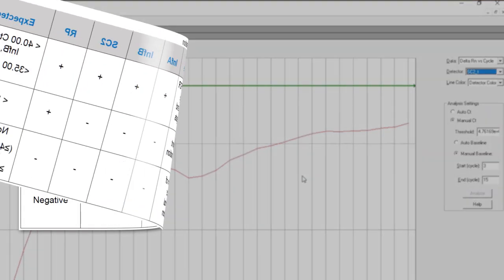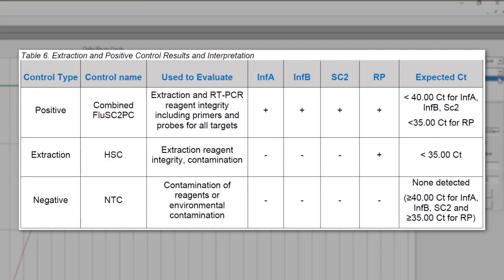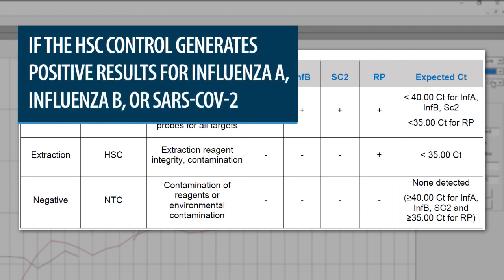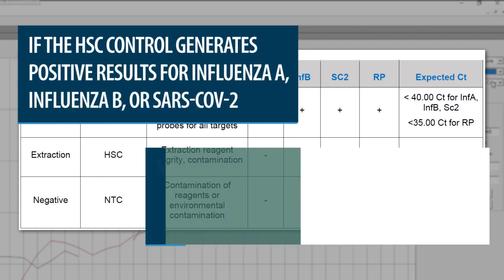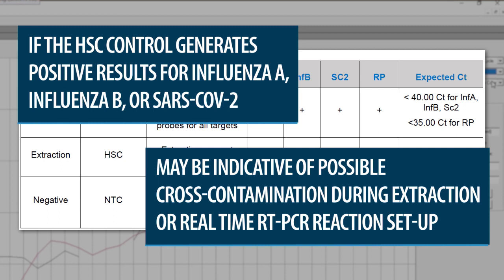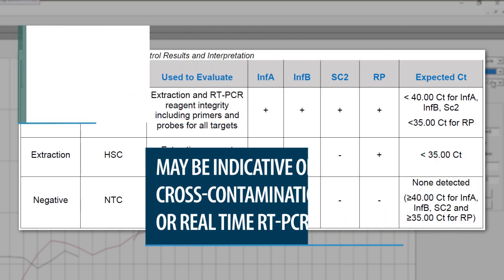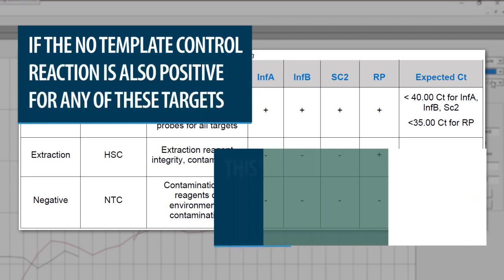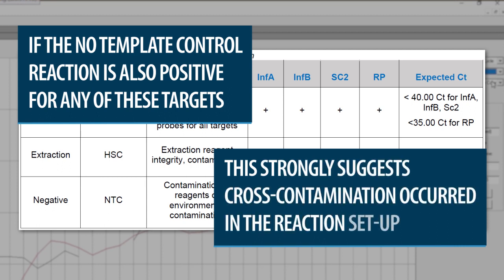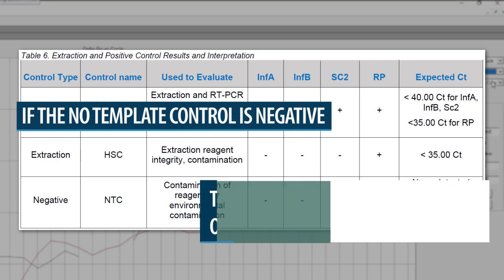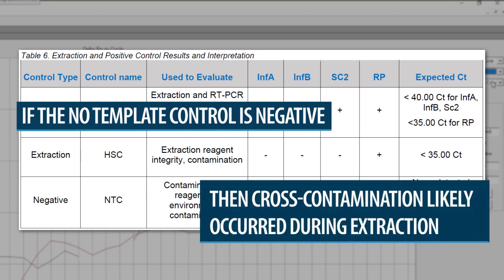If the HSC control generates a negative result for RNAs P, this indicates a potential problem with the extraction process. If the HSC control generates positive results for influenza A, influenza B, or SARS-CoV-2, this may be indicative of possible cross-contamination during extraction or real-time PCR reaction setup. If the no-template-control reaction is also positive for any of these targets, this strongly suggests cross-contamination occurred in the reaction setup. If the no-template-control is negative, then cross-contamination likely occurred during extraction.